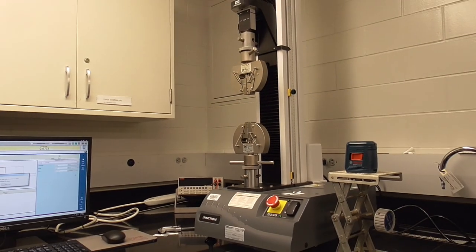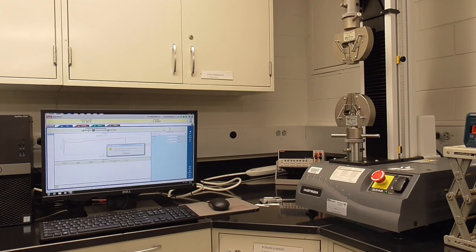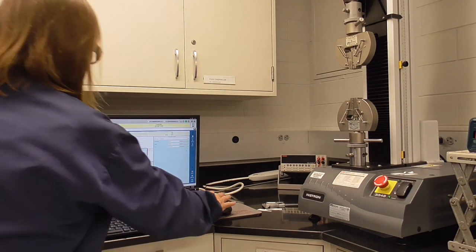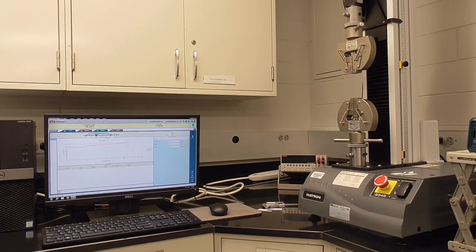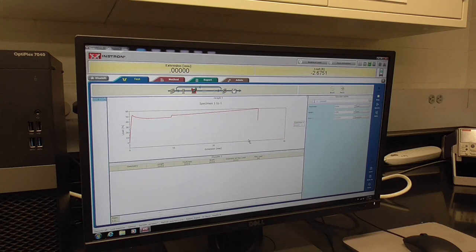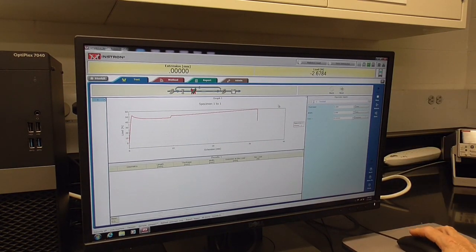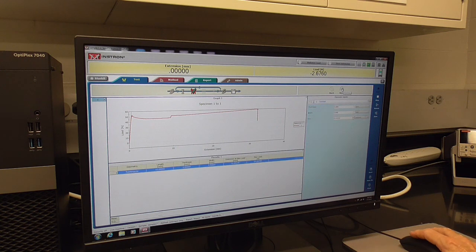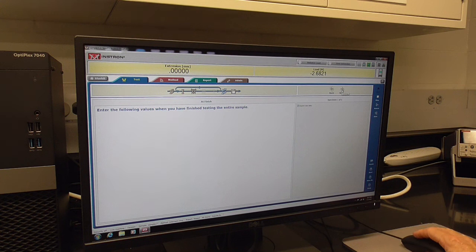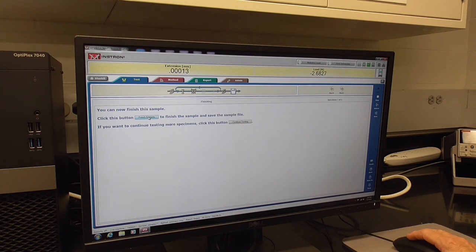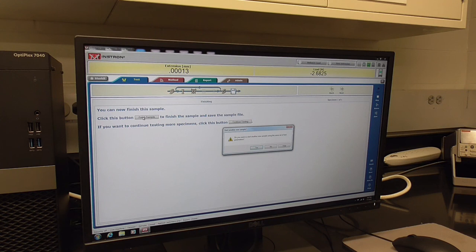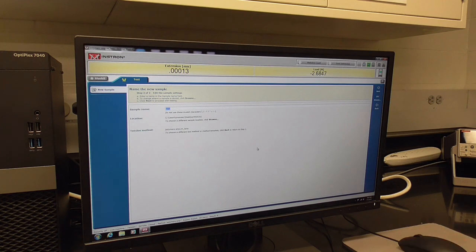Now I'm going to hit OK on the software and you'll see the grips go back to zero. In order to complete the test back here at the software, we are going to hit next. When we do that, it wants you to export the raw data and then click this button, finish sample, to finish the sample and save the file. So the file isn't saved until you hit this button. Then a pop-up comes and asks me if I want to test another sample. If I'm done for the day, I can say no. But if I do want to test a second, I hit yes, and it starts all over for the second sample.